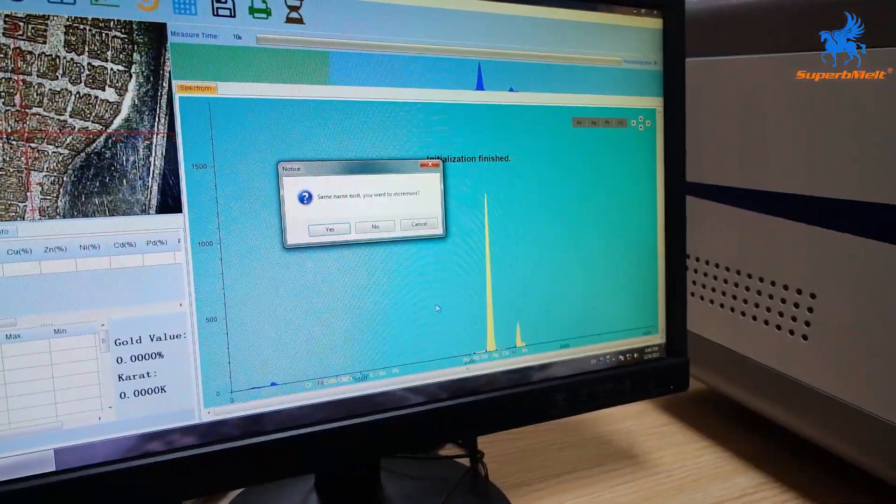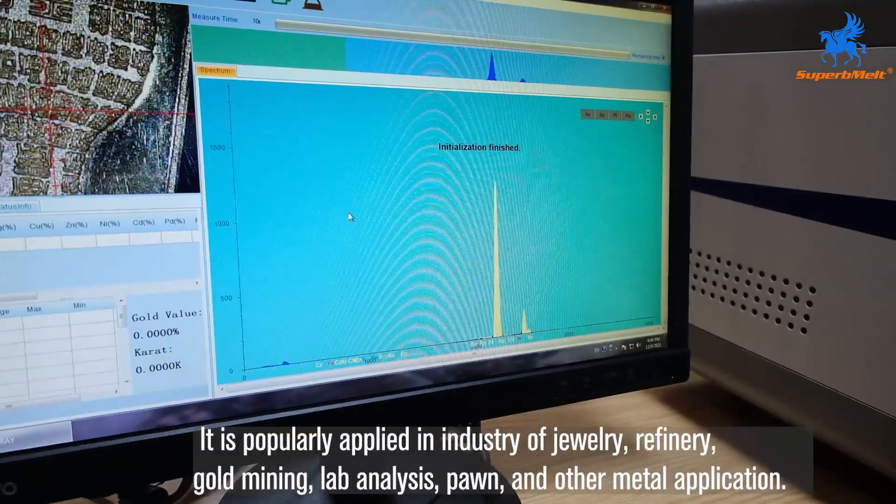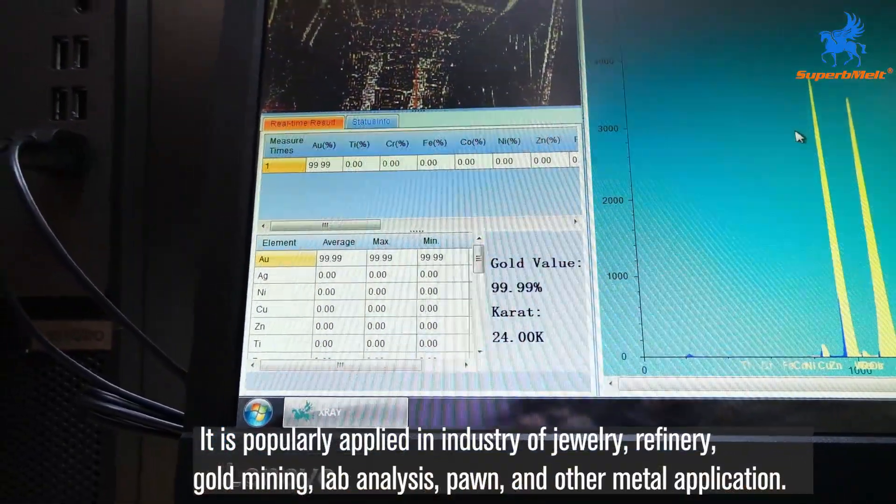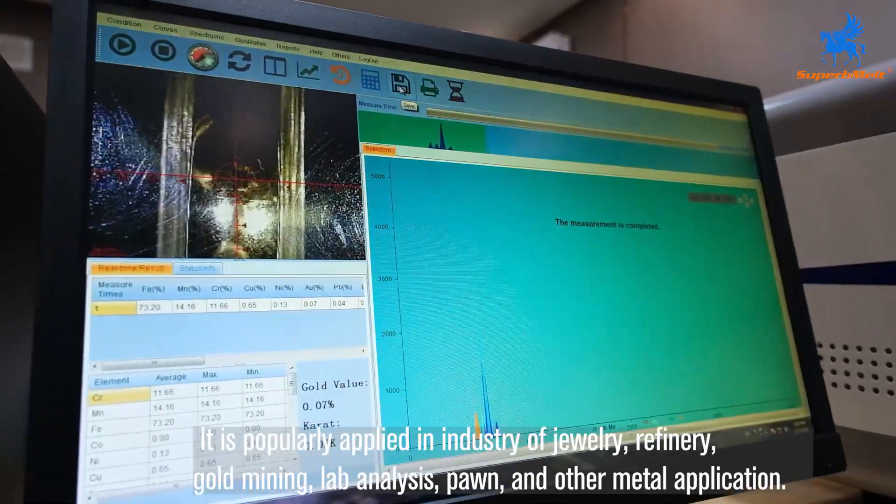Copper, zinc and so on. It is popularly applied in industry of jewelry, refinery, gold mining, lab analysis, pawn and other metal applications.